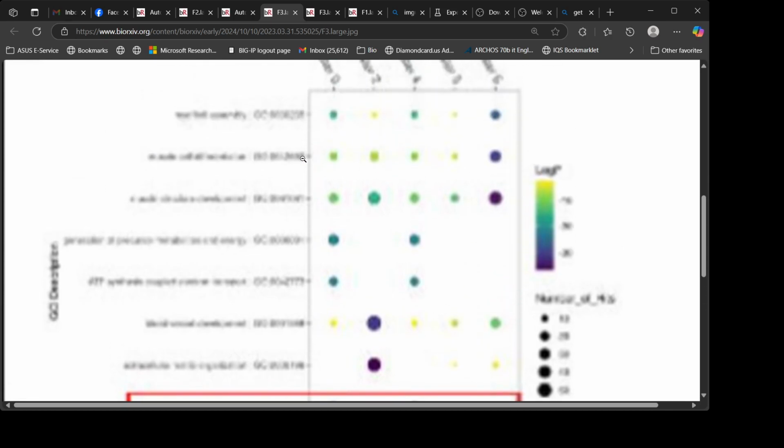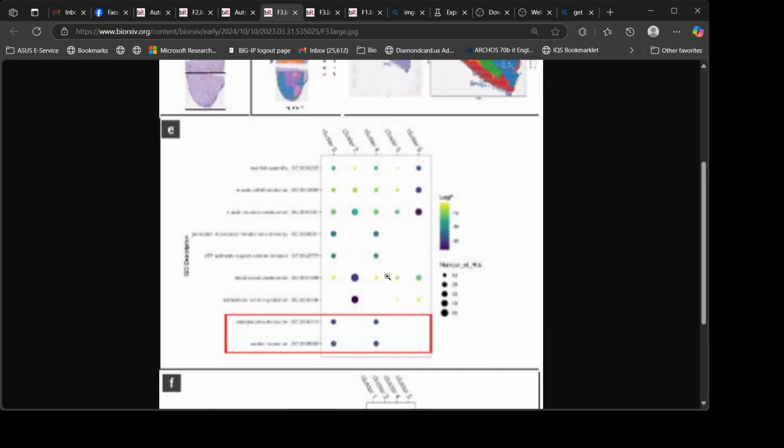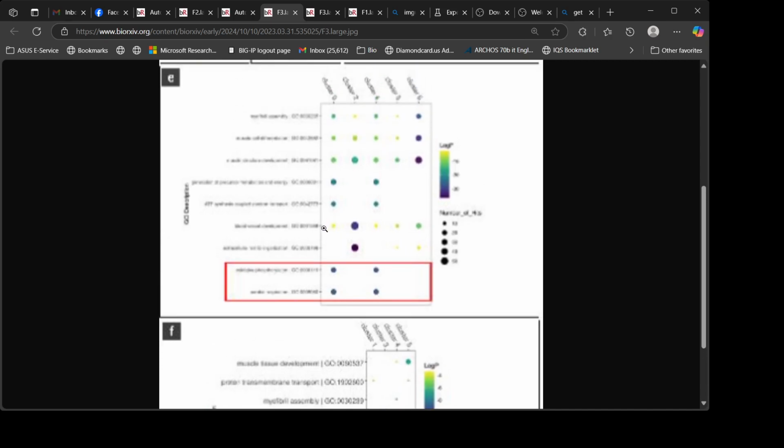center of the tumor. We then sought to validate this upregulation of oxidative phosphorylation and aerobic respiration in the clusters identified through the STAGATE algorithm. First, we validated the signature against an additional tumor section taken from the same patient that did not need to be divided across Visium capture areas, Figure 3e. This served to confirm that the molecular signatures were not an artifact from VR-Omics' multi-slice, coplanar analytical approach.